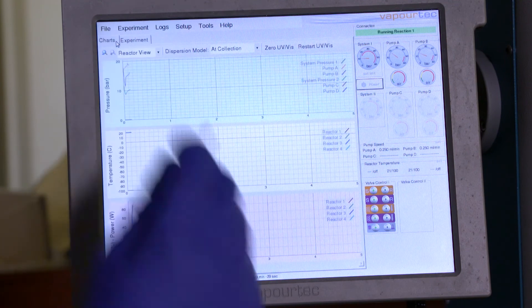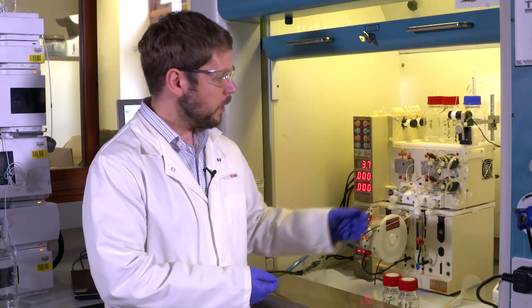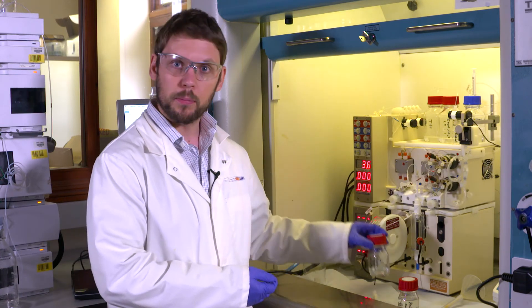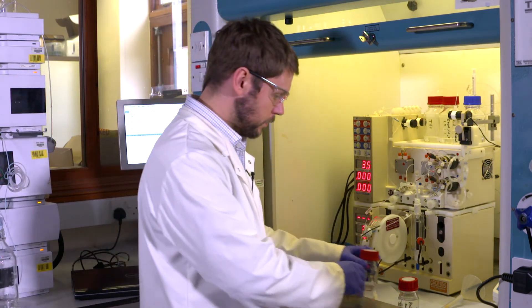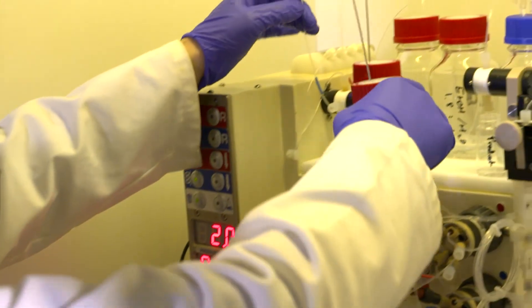I can change the view to have a look at the reaction as it's running. If you want to scale a reaction up, instead of using the sample loops you can pump directly from the reagent bottle. Let me show you how to put them on. First I need to put the reagents onto the reagent lines.